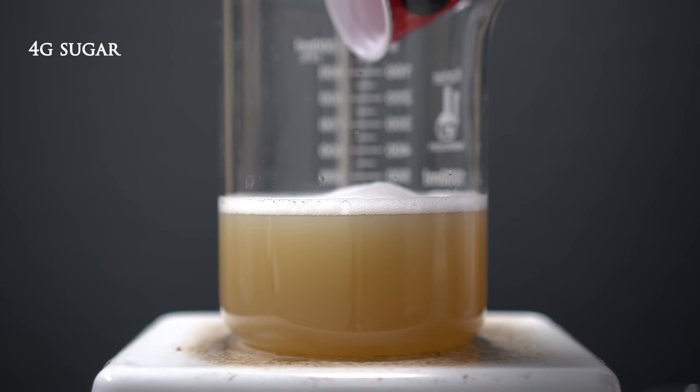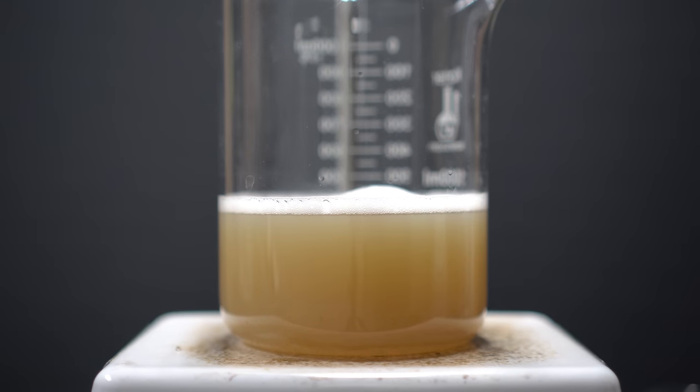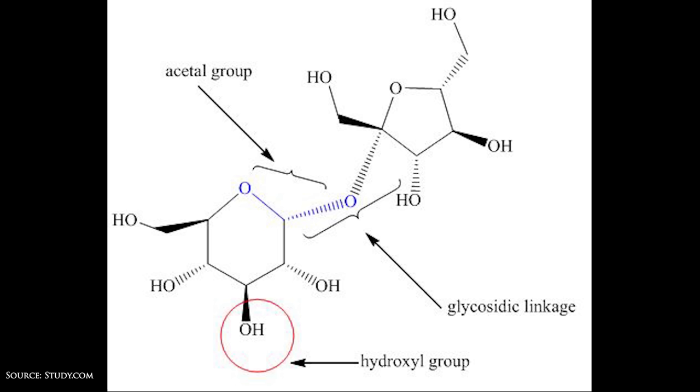I decided to go forward with the procedure and added four grams of table sugar. You might ask why this forms a mirror: the sugar is a reducing agent and Tollens' reagent — which is what we made — is an oxidizing agent. When they come into contact, the sugar is oxidized and the Tollens' reagent is reduced, ejecting silver in its elemental form to coat the glassware. However, after quite some time nothing formed. Tollens' reagent reacts with aldehydes, and looking it up, table sugar is mainly sucrose. The sugar Nerd Rage used must have had glucose, which has an aldehyde group. My sugar only had hydroxyl, glycosidic linkage, and acetal groups — so it makes sense why nothing happened.